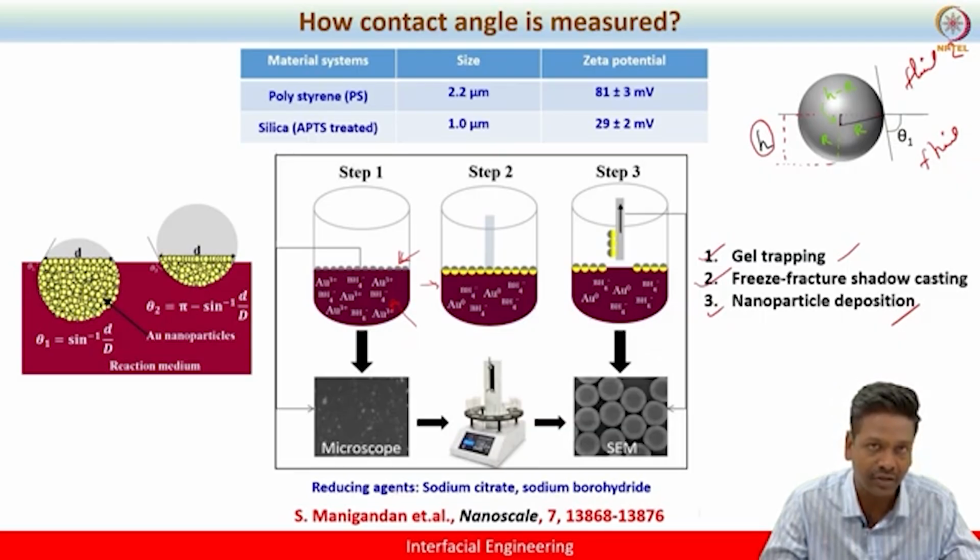The chloroauric acid will sit on the surface of the polystyrene, whereas the sodium borohydride will help reduce the gold precursor, so that the nanoparticle nucleates on the surface itself and grows over the surface. This is how you create a deposition of nanoparticles on the surface exposed to the water side. Remember, there is no deposition on the air side, because there is no wet chemical reaction going on the air side.